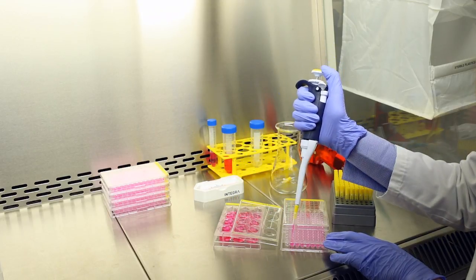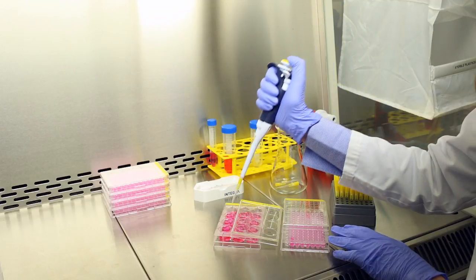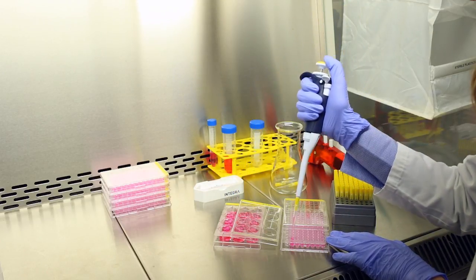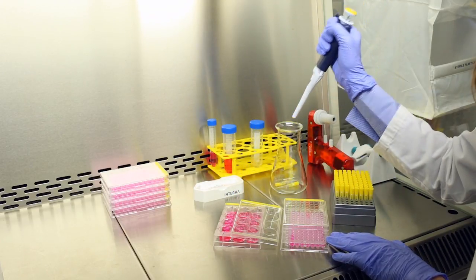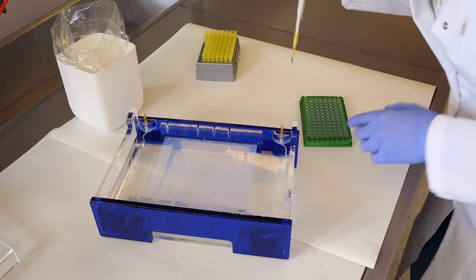Many applications require pipetting between different labware formats. For example, plate reformatting from 12-well to 96-well plates, or transferring samples from tubes or plates to agarose gels.